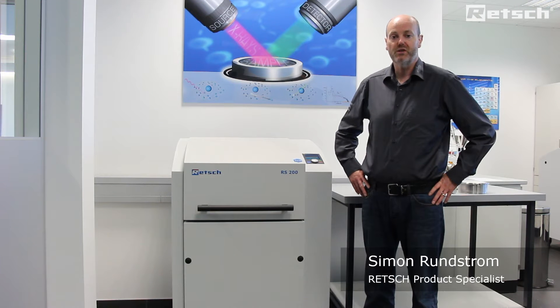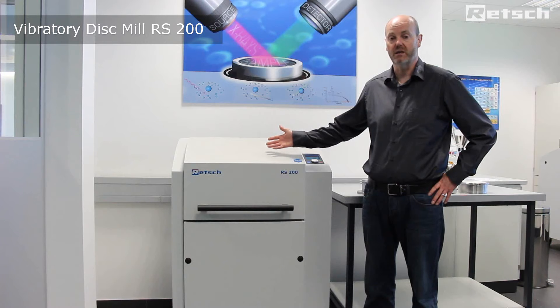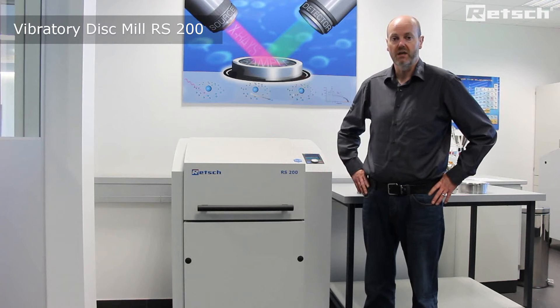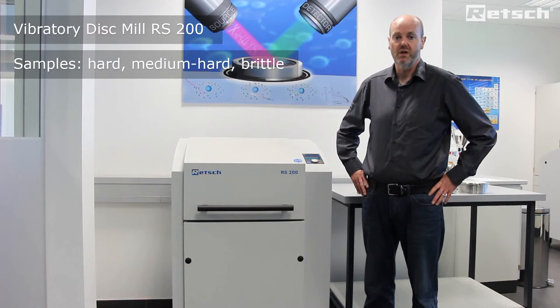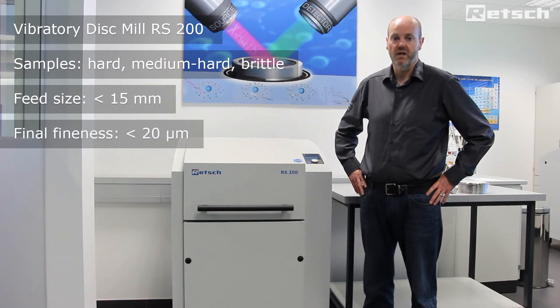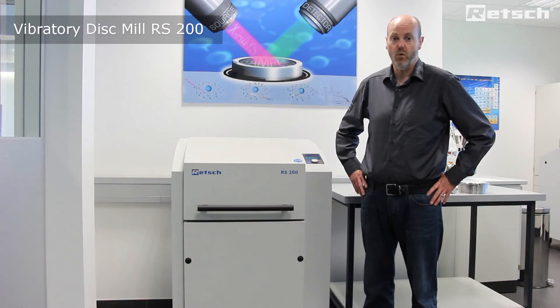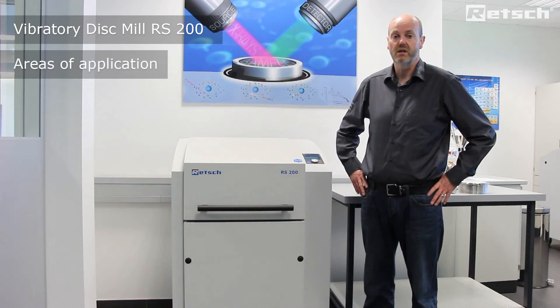Hello, I'd like to take this opportunity to introduce the RS200 vibratory disc mill. It is a ring and puck mill that is primarily used for the preparation of sample materials of a hard, medium hard and brittle nature, from approximately 15 millimetres down to 20 microns in just a few short seconds. It is an extremely powerful instrument that is used in a wide variety of application areas.